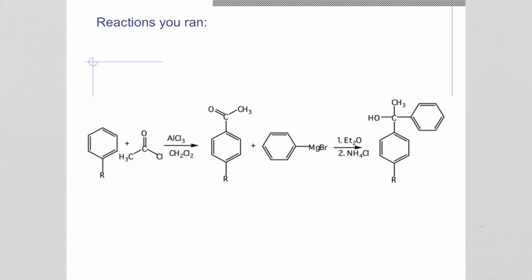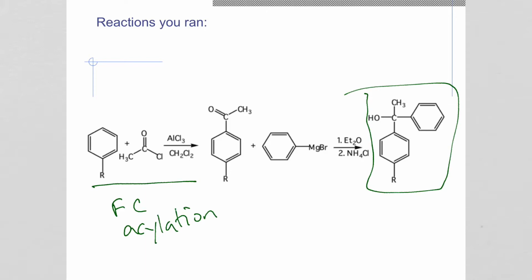This video is to discuss an overview of the purification of the alcohol that you isolated at the end of your two-step reaction process. Recall, you took an alkyl benzene and did a Friedel-Crafts acylation reaction, which is an electrophilic aromatic substitution reaction. You then took the product you isolated from that and reacted it with phenyl magnesium bromide in a Grignard reaction to give you this alcohol product.